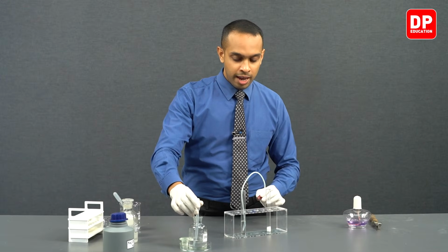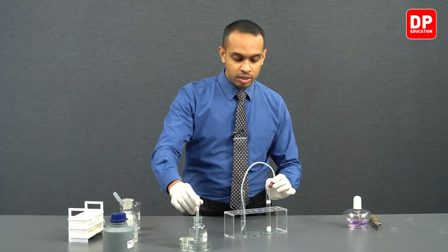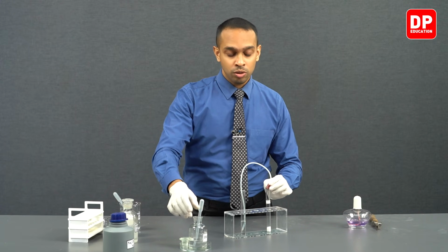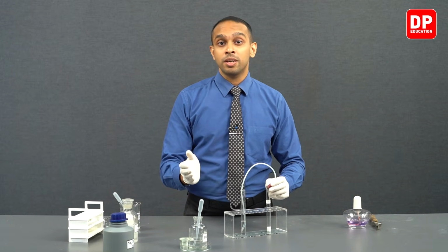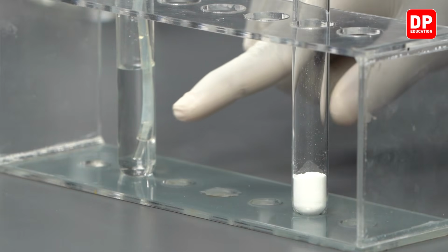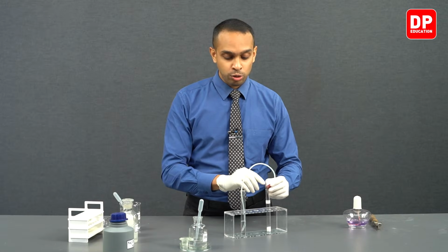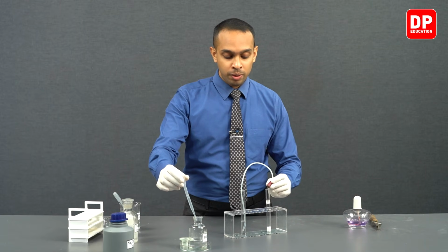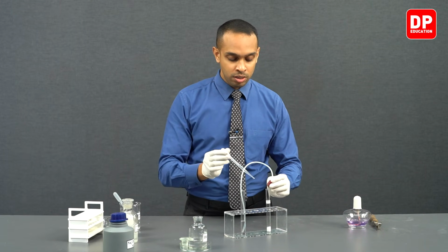Now students, as soon as we add our HCl, we have to close the stopper, otherwise carbon dioxide produced will be released out of the test tube, so you will not observe the lime water turning milky. So as soon as you add the HCl, make sure to place the stopper and close the test tube.